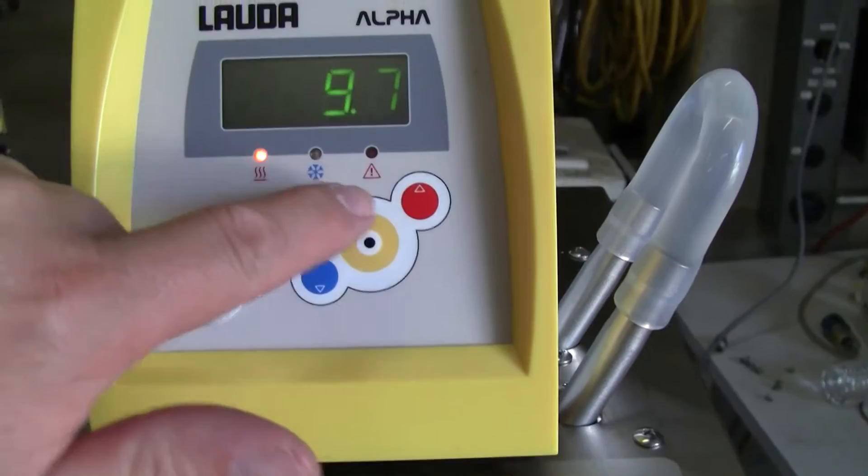You can hear the compressor just went off and it went into heating mode. Heat, chill, air. This particular unit runs on 115 volts.